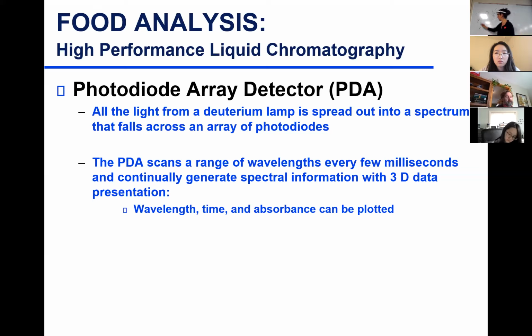So here you have absorption over time. So you only see absorption over time at 272 nanometer. That's all you can observe. So that is peak 1, peak 2, constituent 1, constituent 2. If you change during the run, you change it to different wavelengths. Maybe the constituents here did not show up at 272 at a particular time point, 20 minutes, let's say. You changed it to 220, then you observe another peak here. That did not absorb at 272, but you changed it during the run, then you can see that.